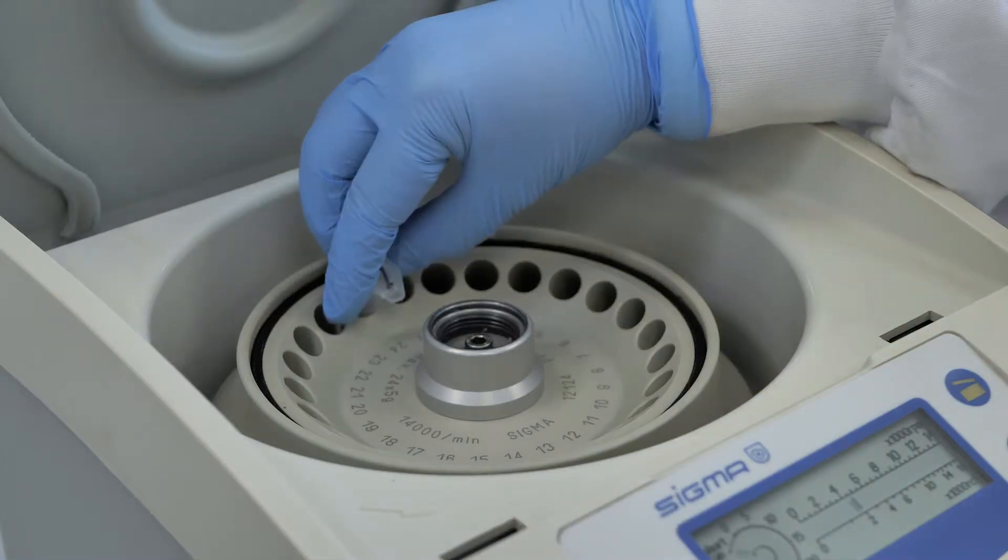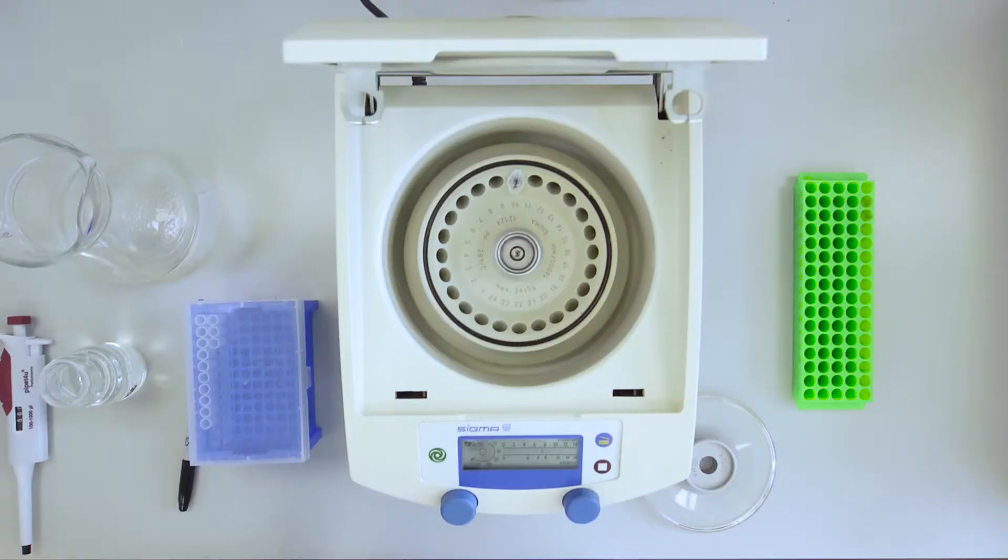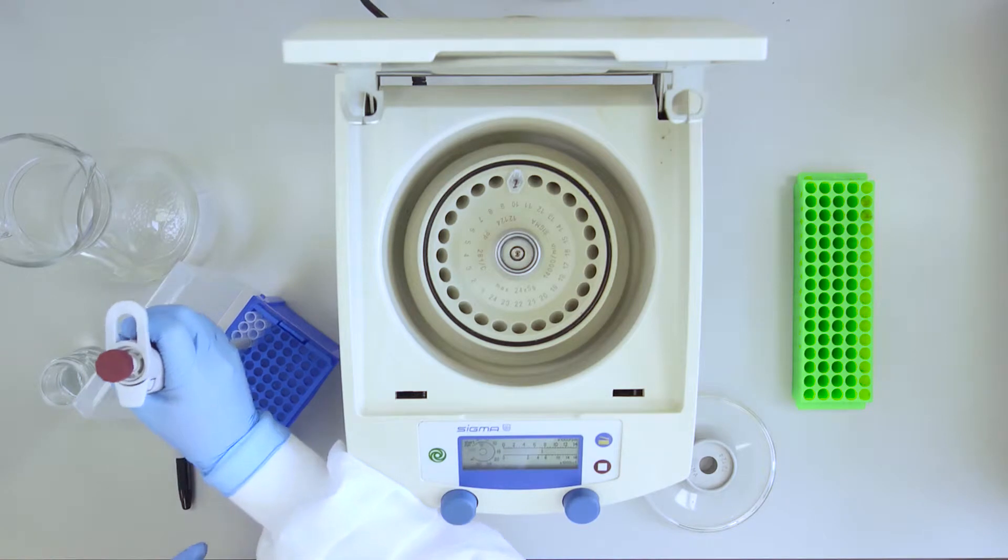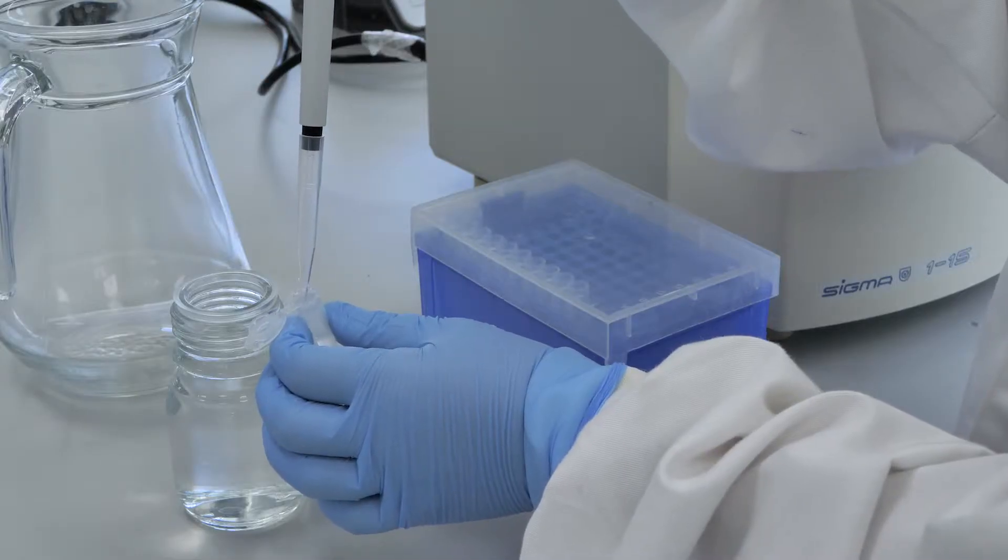If you are only spinning one sample, you will need to make a balanced tube of the same mass to load directly opposite the sample tube to ensure forces on the rotor are balanced while spinning.